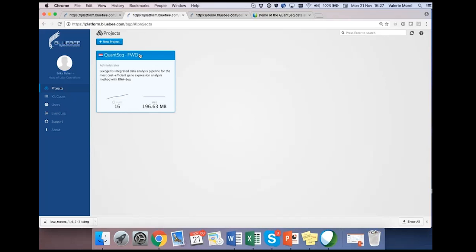Okay, so I continue. May I change the parameters of the pipelines, for example, genome to align to, annotation to be used with the HTSeq count? So far, we have preset genome annotations for the pipelines. It's the Ensembl annotation of human, mouse, rat, and pig.